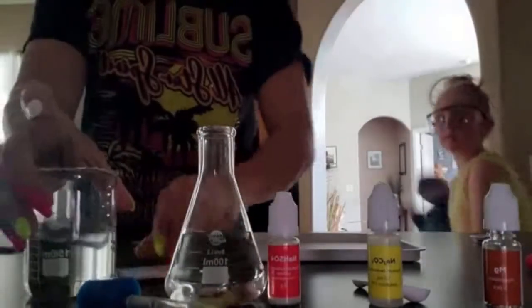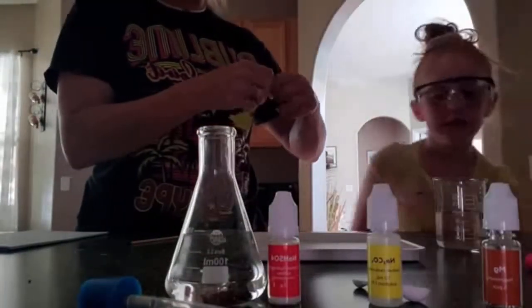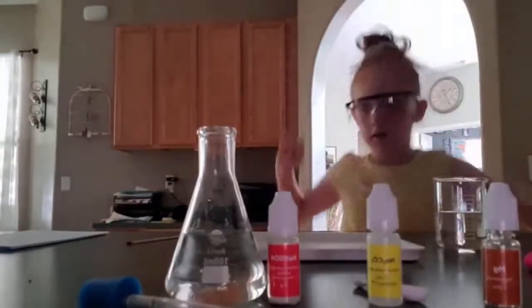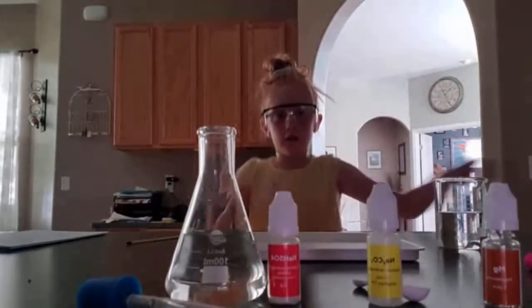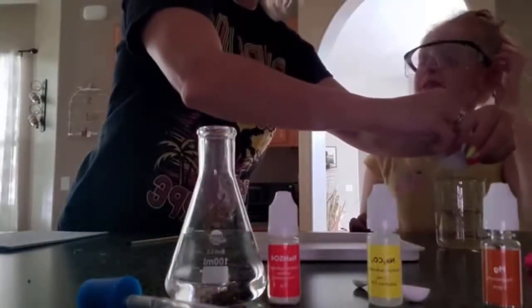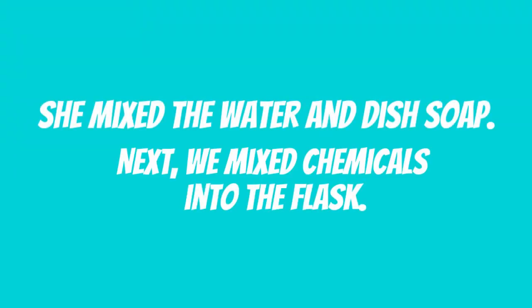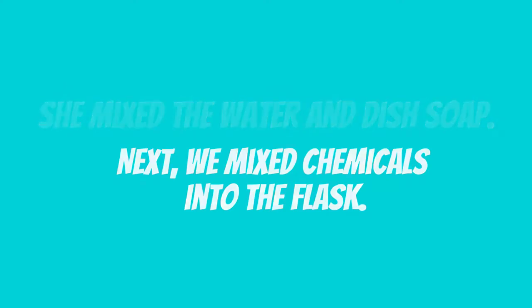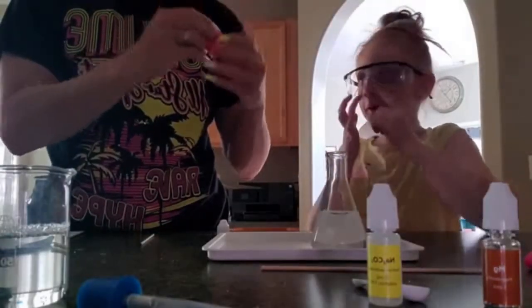First things first, you've got to add soap to your beaker. Soapy, soapy, soapy! There we go. It's like a little beach at the bottom that got flooded.